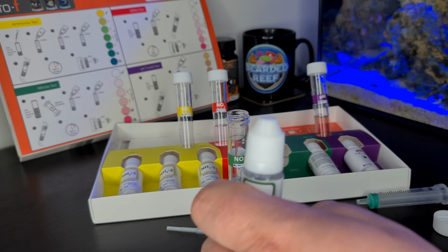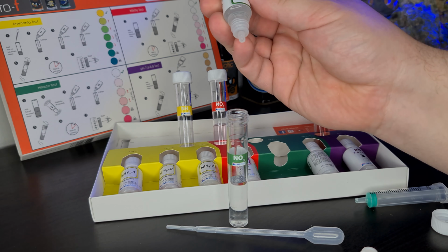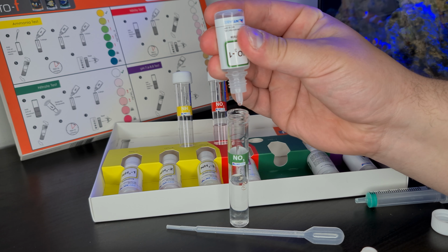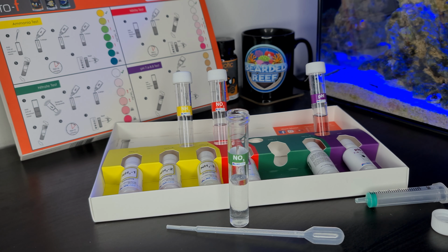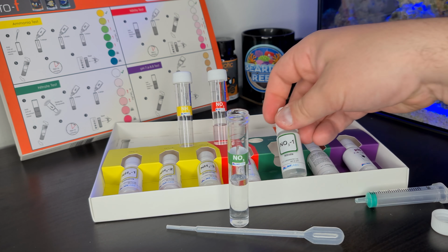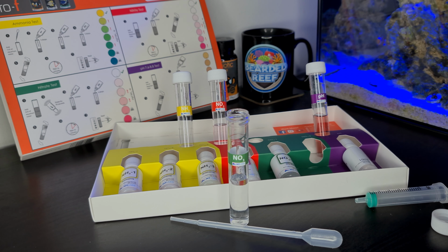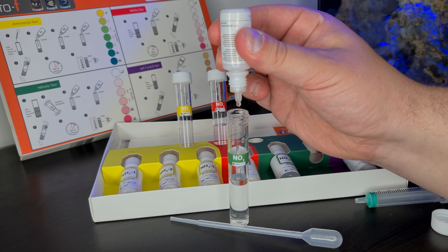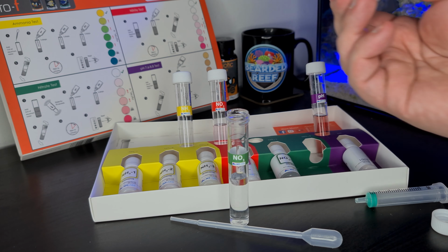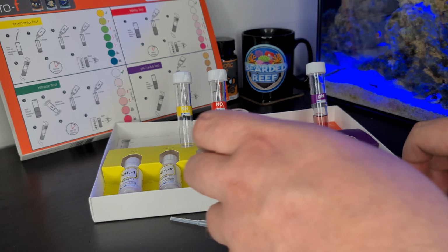Okay, so that's been 30 seconds shaking that bottle. So it says now add 6 drops in here. Okay, so 6 drops in there. Remember to put the lid tight on these if you're doing this. Okay, and then 6 drops of bottle 2. Same thing again, invert this a few times, and then we've got our 10 minute wait on this one.